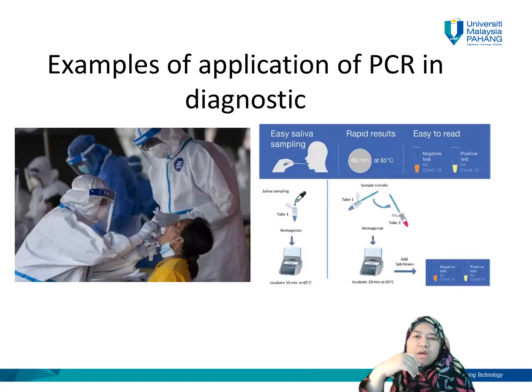Okay, one example of using PCR in diagnostics is by using the real-time PCR. So the rapid result, whether you use the antigen-based or the real-time PCR.